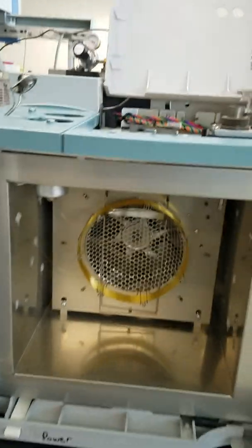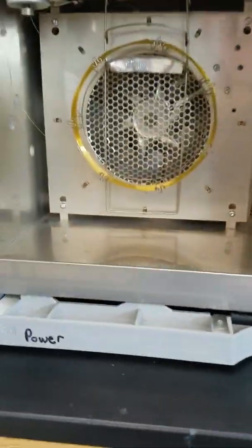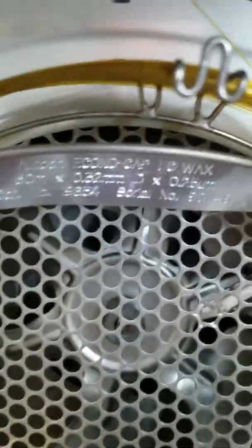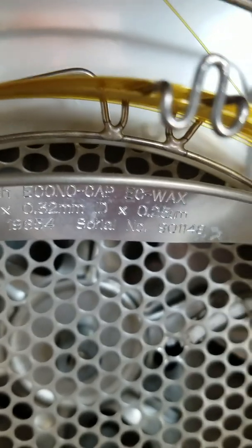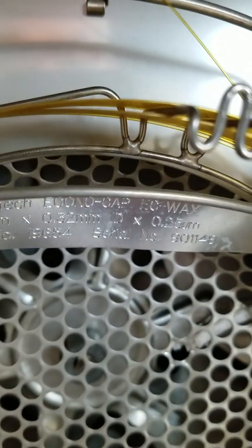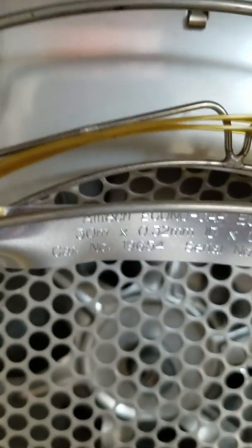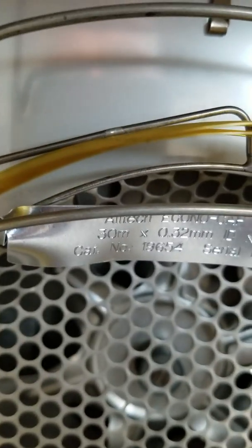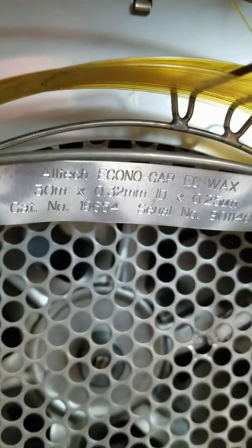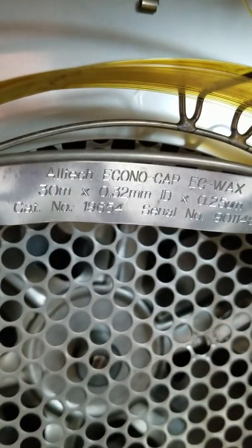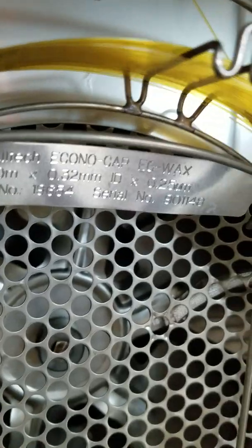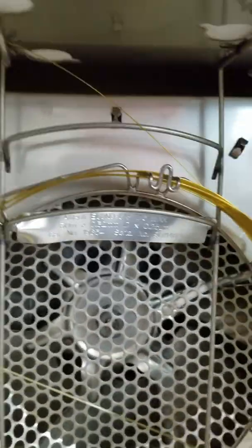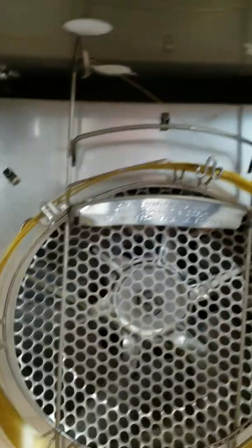One of the things we have the option to do: since most of these analytes we're analyzing for are polar compounds, the type of column here is a carbowax. You can see it's an Alltech Econocap EC wax type column. This column's polar.